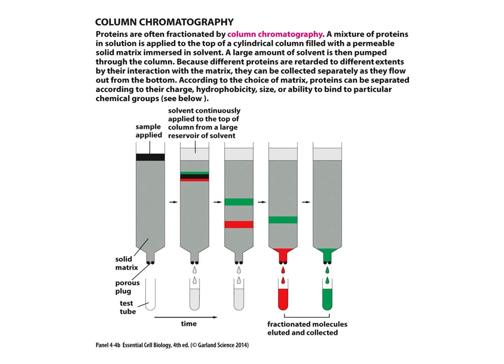Okay, so depending upon what the matrix is, that changes how the technique is done, what material is going to come off when. But again, the idea is that we have this mosaic of proteins that we're putting over this column through the sample, but we're able to actually isolate the different ones. We then could use these different fractions to do additional tests, like a Western blot, like an ELISA.